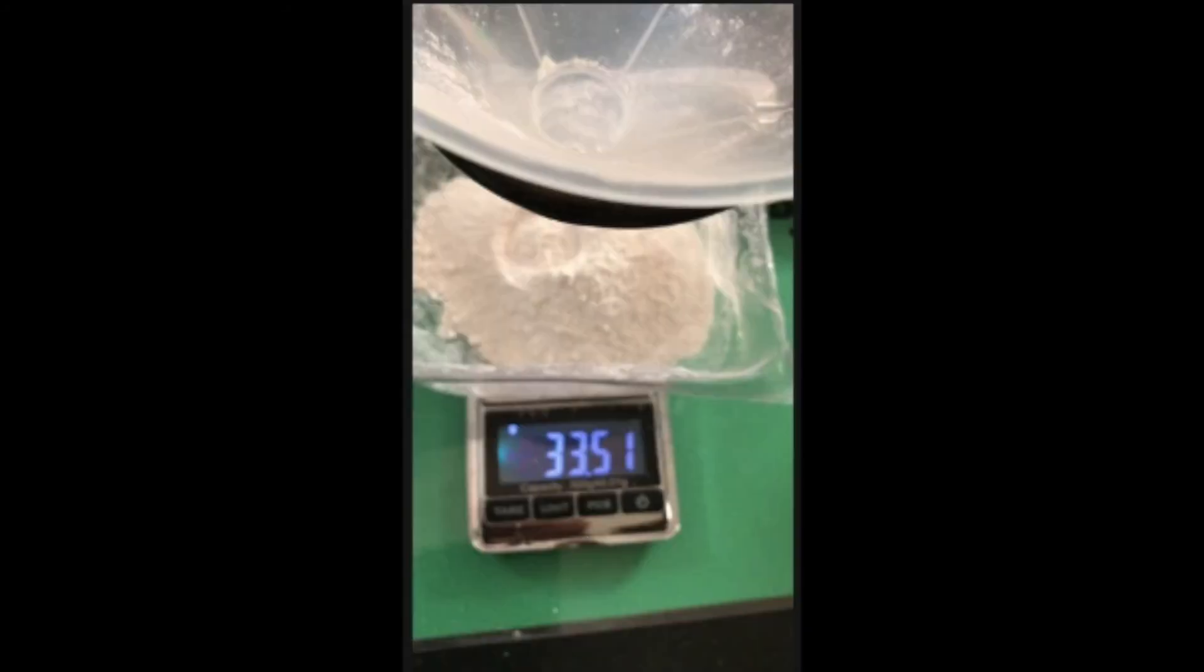I have the final yield of 33.51 grams of calcium hydroxide. This is really weird because the stoichiometry calculations had my predicted yield as 24.8 grams.